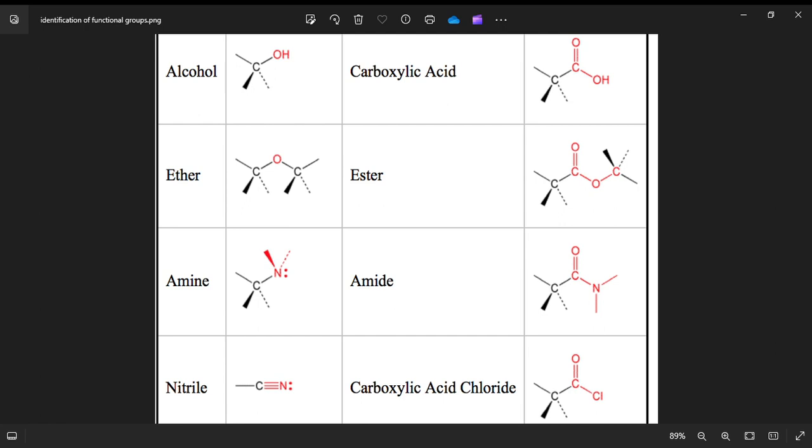We can't go over the manual to be checking all the procedures, but note, for phenol, there will be no effervescence and a colored solution will be formed. That is for phenols. Either it gives you green colored complexes or blue colored complexes with iron chloride.